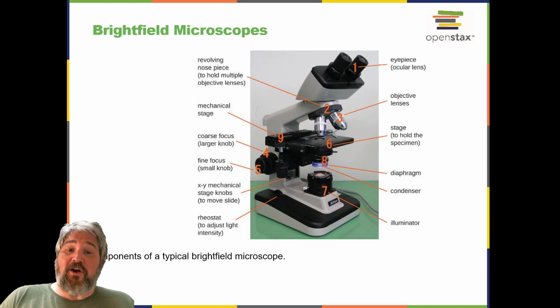Often chromophores are artificially added to the specimen using stains, which serve to increase contrast and resolution. In general, structures in the specimen will appear darker, to various extents, than the bright background, creating maximally sharp images at magnifications up to about 1,000 times.